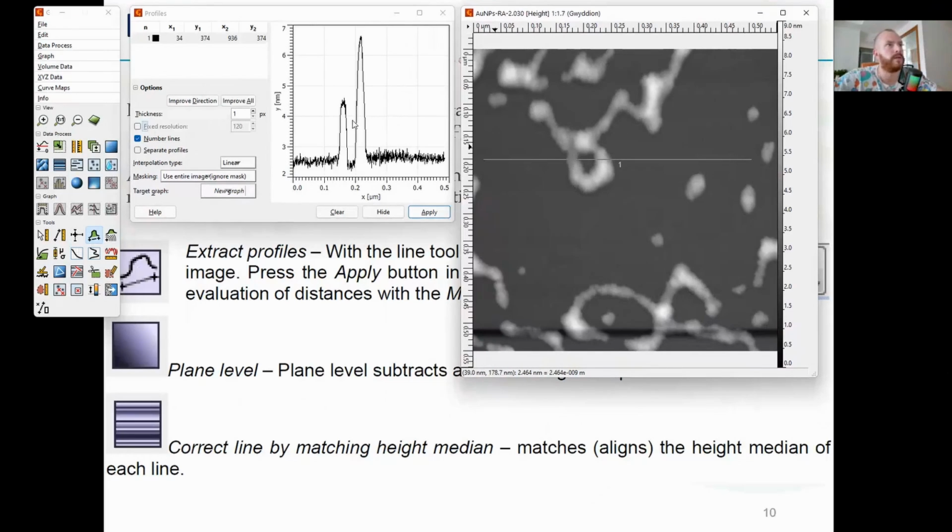So we have some kind of helices of DNA lying on the surface. And we have a profile. We can measure, we'll do it a bit later, we can measure the width. So it's less than what? Less than something like 30 nanometers. We can measure the height. It's like, well, 2.5 and 4.5, so it's about 2 nanometers.